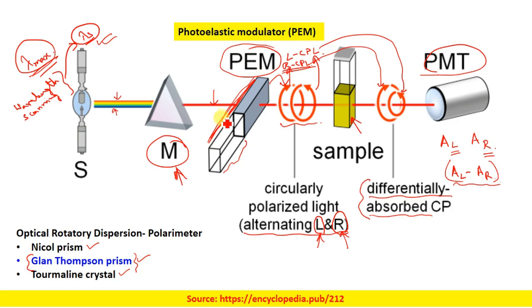The polarizers are integrated with the photoelastic modulator, hence in this diagram it has not been shown.